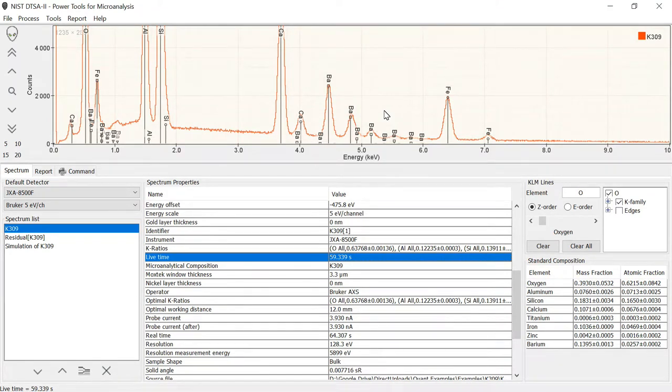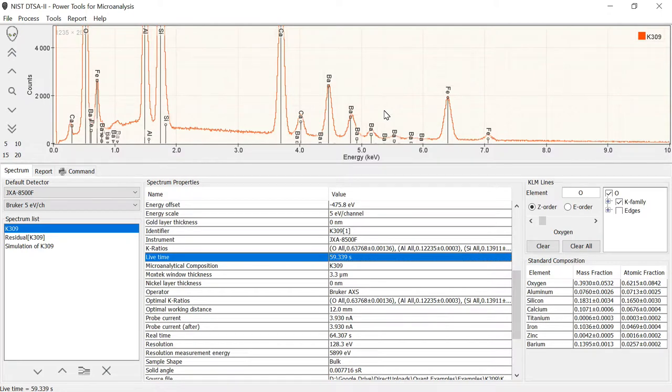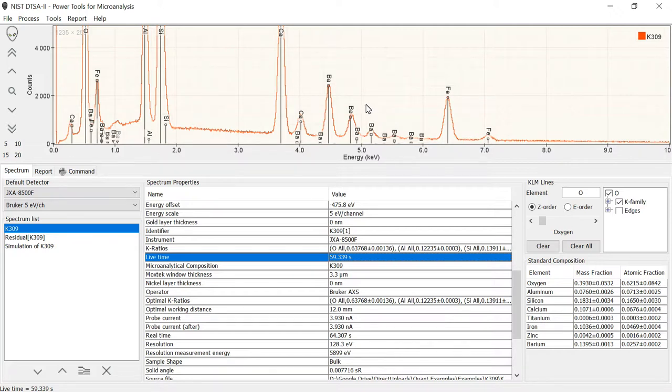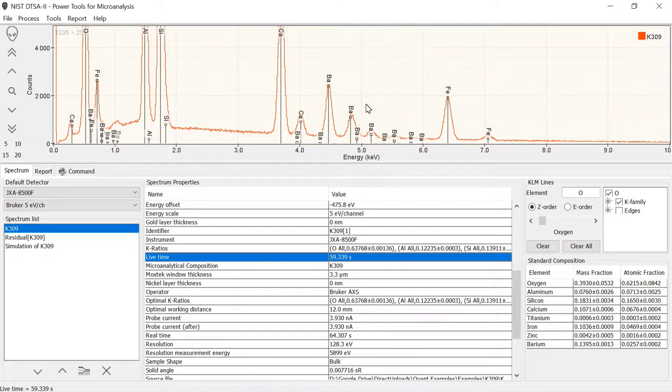We had just demonstrated how you can go about quantifying a spectrum like K309 using the quantification tool. What we're going to do now is a complementary tool and a very good one for learning about X-ray microanalysis. We're going to simulate that spectrum.